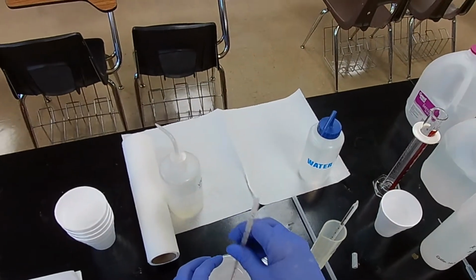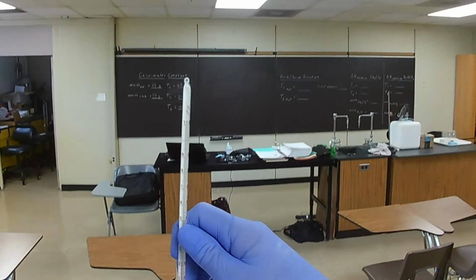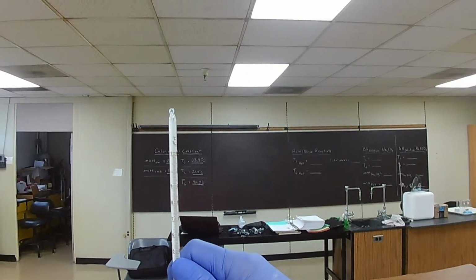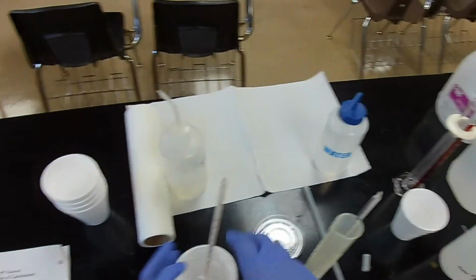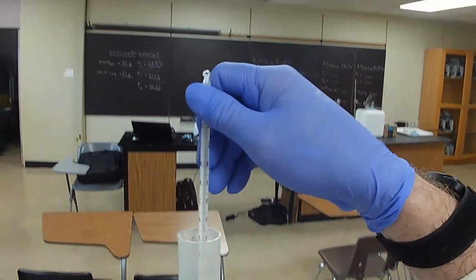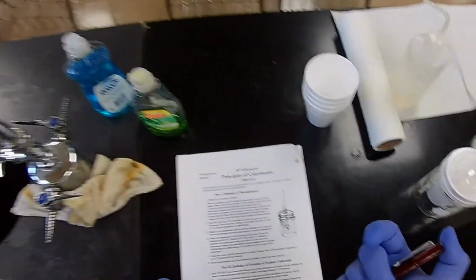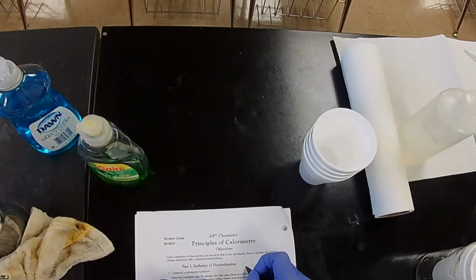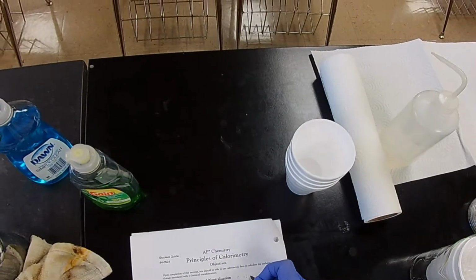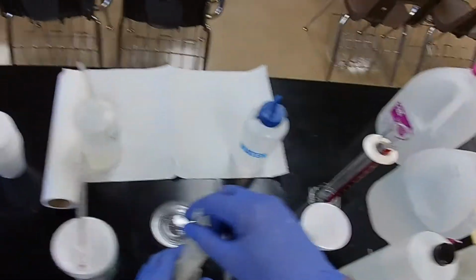All right, so let's see what the temperature is for the acid. Let me hold it up to eye level. I got 21.5. And for the potassium hydroxide, exactly, 21.5. Very good. 21.5 degrees is initial. Temperature initial for both, 21.5 degrees centigrade. So when we add them together, we should see a rise in the temperature. Ready?